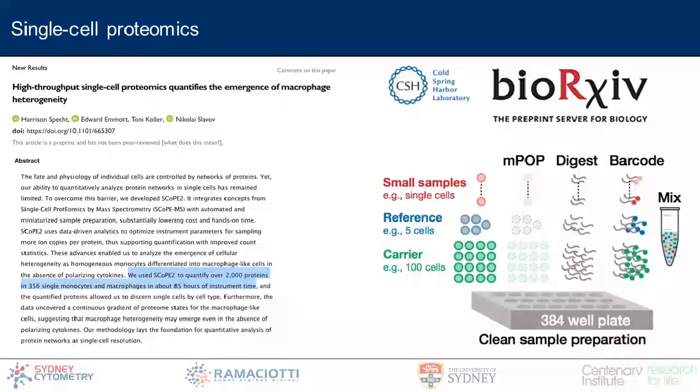There is even some single-cell proteomic work being done out there. This is a little bit more on the developmental edge, but we always like to keep an eye on this because we find it very interesting. The idea of doing proteomics, not using antibody reporters like we do with mass cytometry, but genuine single-cell proteomic measurements. But this is at a rate which is probably not compatible with a lot of studies at the moment, and it's not at a commercial level, but we're watching with eager anticipation to see how this evolves over the next few years.